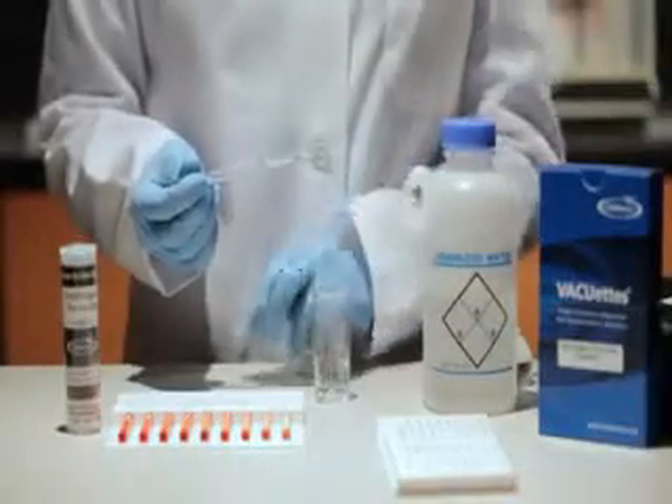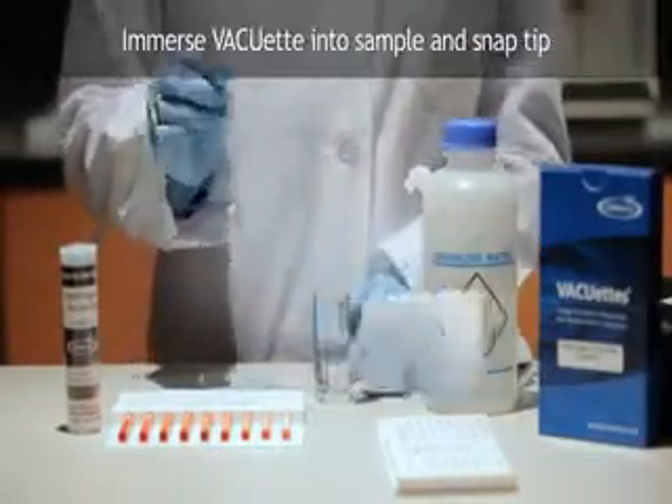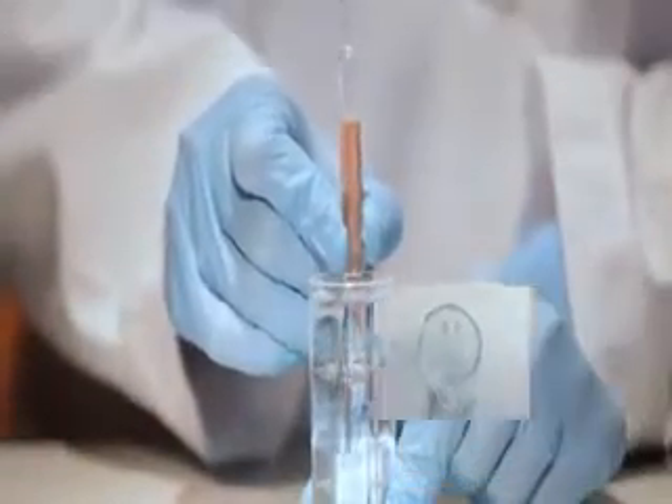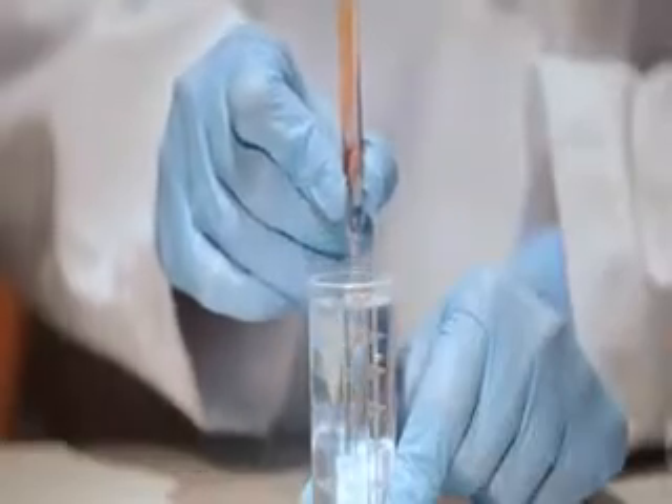Insert the VACUETS between the vertical tip guides on the inside of the diluter snapper cup and snap the tip. The ampule will fill, leaving a bubble to facilitate mixing of the sample and reagent.